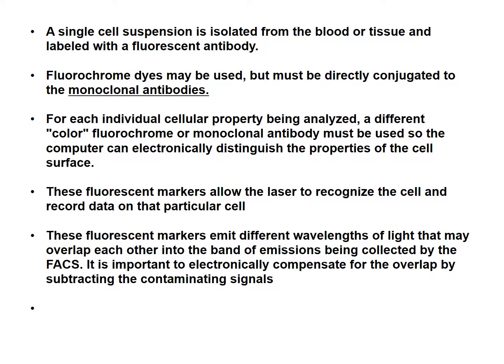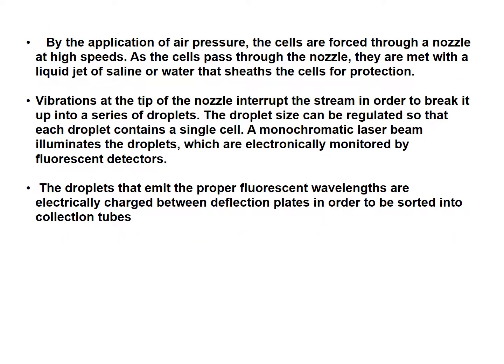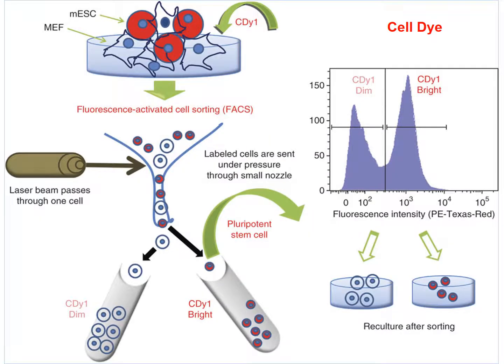And this may be some words. I believe it pretty much discusses what we've talked about. And just in talking about the vibration, the tips. So here are some cells, and it looks like they're stained with a certain dye. Looks like it's red here. So you have cells that are stained and cells that are not stained.